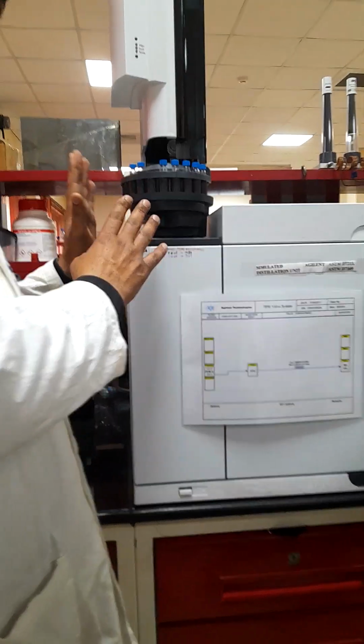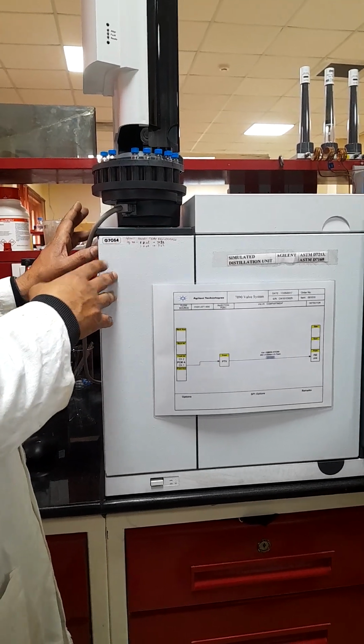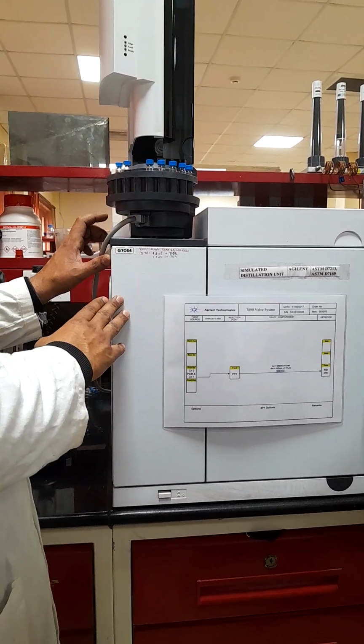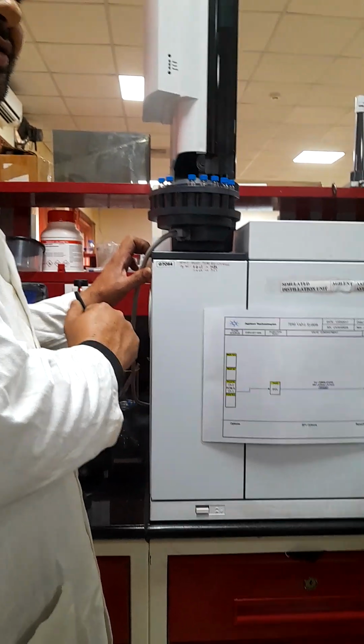Programming. In programming, why is burning required? Burning is required to detect which type of hydrocarbon is coming. We are using FID as the detector, so FID requires burning. You only flow the gas.